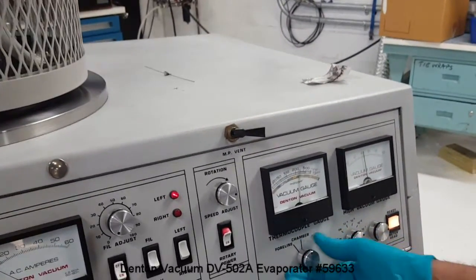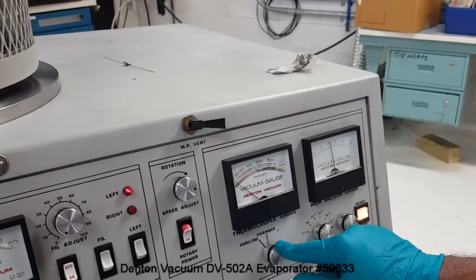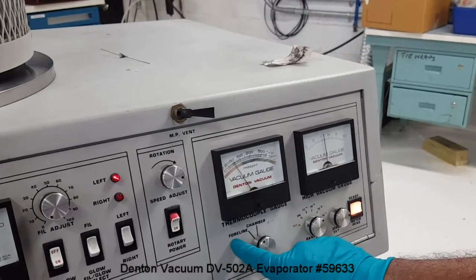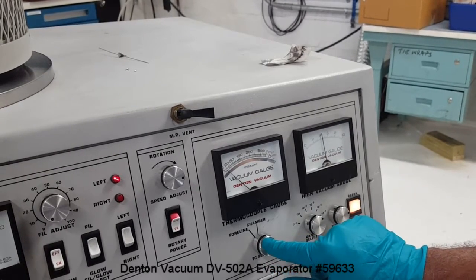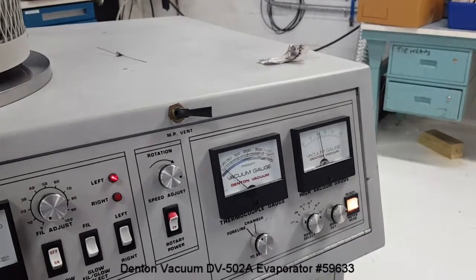This is a thermocouple gauge using which we can measure the chamber vacuum level during roughing, and the fore-line vacuum level while the diffusion pump is on and the backing valve is open.